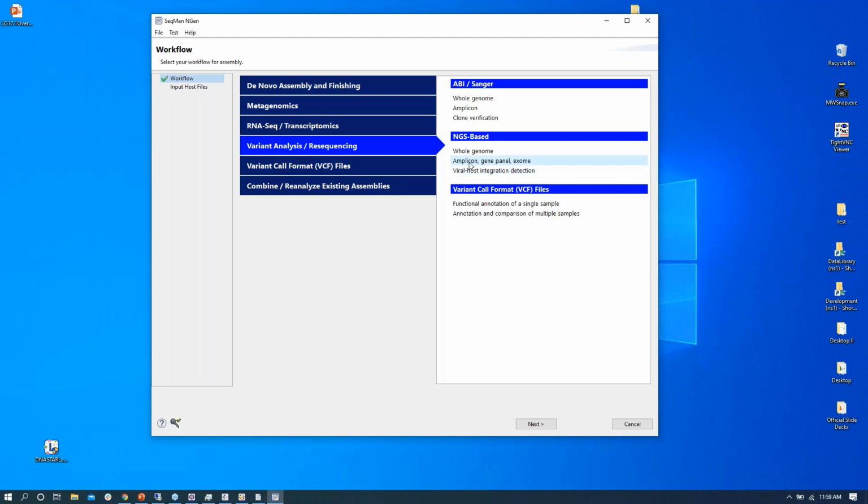But this makes it a lot easier to find those reads that contain both viral sequence and host sequence, so those chimeric reads at those insertion sites. Again, I won't go through the whole workflow here, but we have a workflow page on our website that will explain this in more detail and provide more information if you have questions on it.